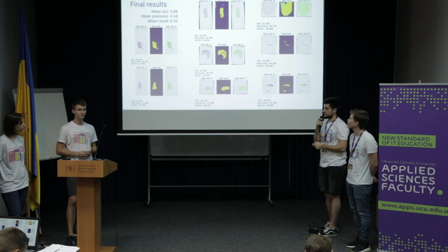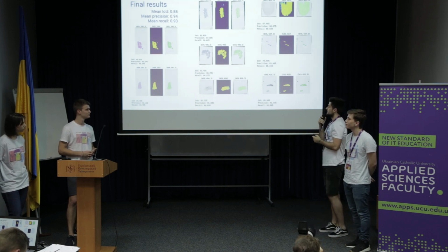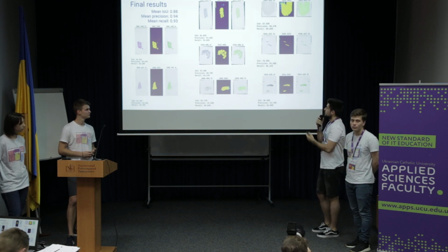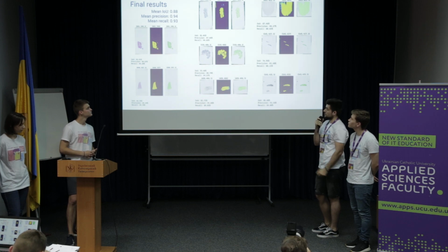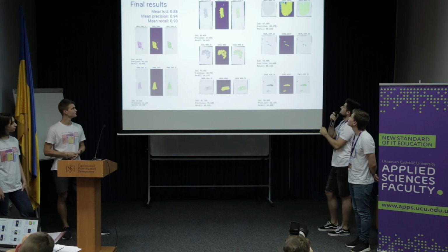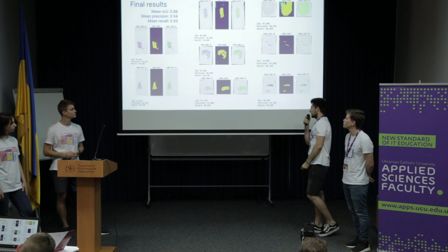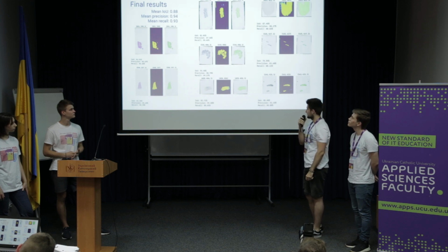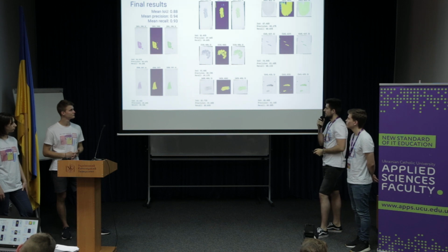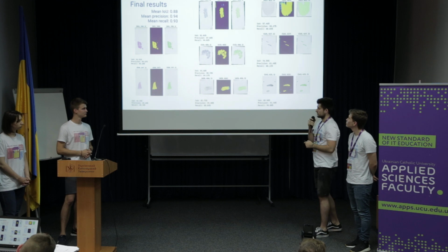So then after various iterations and various trainings, we arrived at the final model, which is a UNet model, which Ilya described. We were able to get to a precision of 0.94 and recall of 0.93. We can see improved results on the picture in the top right corner. All other pictures had very good results. And also there was a slight improvement in the picture here, but there is still some dust and water we should treat in the future.